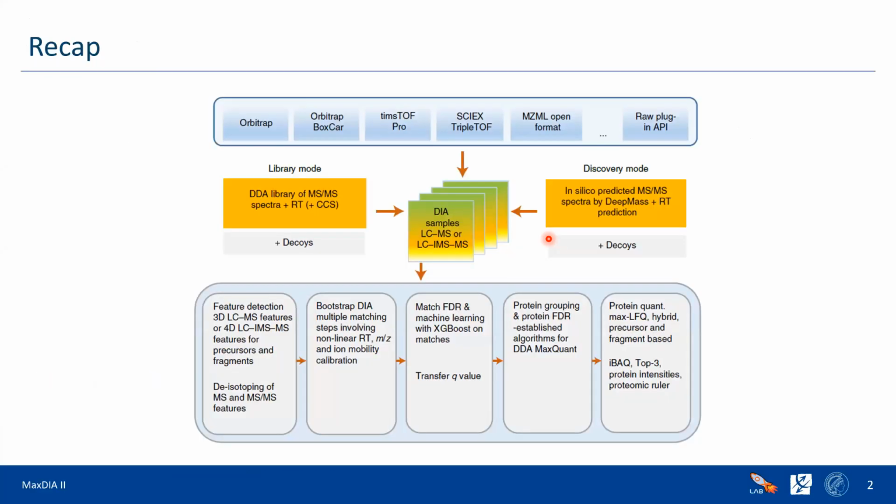Okay, cool. So, recap. If we talk about MaxDIA, MaxDIA is really inspired by the idea: let's take all algorithms, all solutions which work well in the DDA world, and let's try to apply them to the DIA world. For example, feature detection. You can really just easily transfer feature detection from the DDA world to the DIA world.